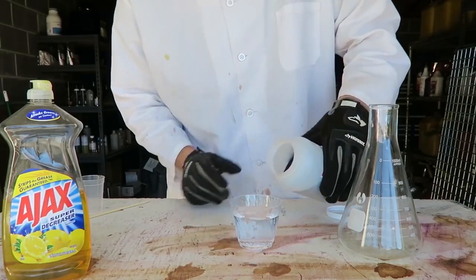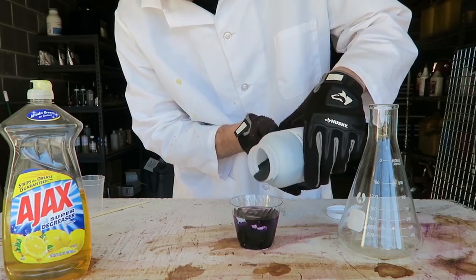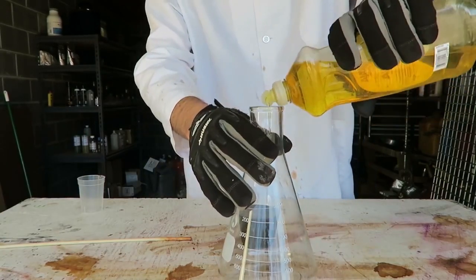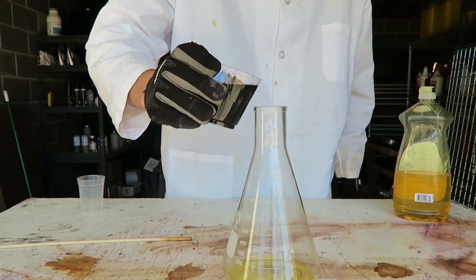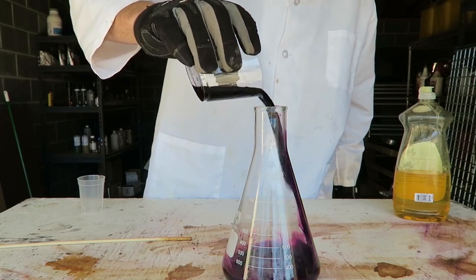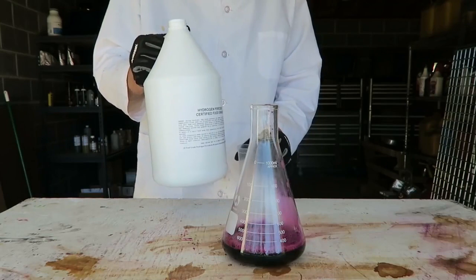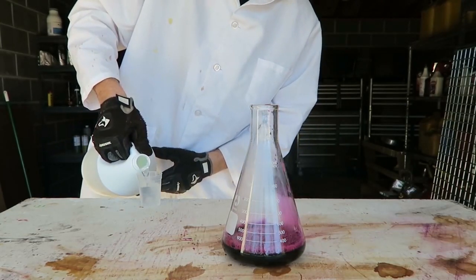First we're going to grab potassium permanganate and mix it with water. Then we're going to mix it all up. Then put dish soap inside this tube. Then put potassium permanganate in this tube and mix it all up. Next, I have food-grade hydrogen peroxide and I'll put it in a small container.